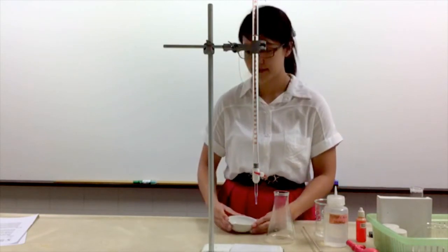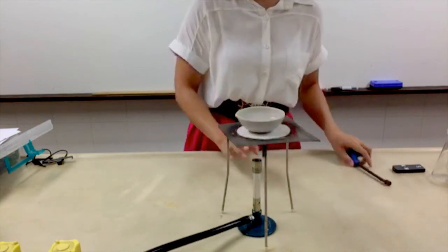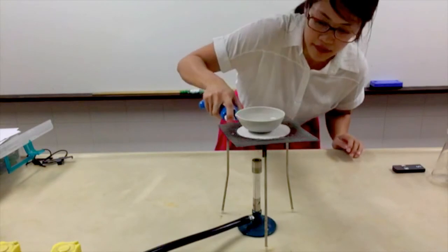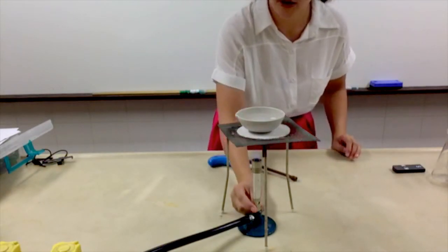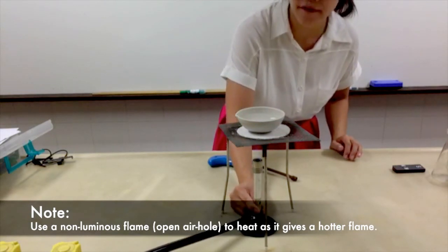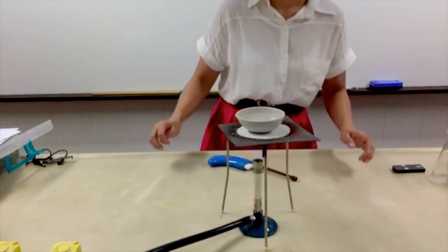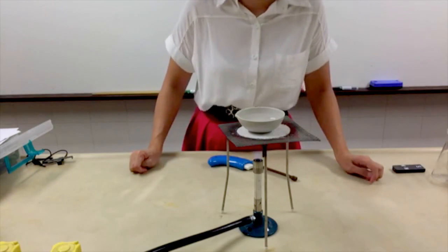Then we will evaporate our solution to dryness and let's see what will happen when we put this on the Bunsen burner. I place my evaporating dish on top of the Bunsen burner and I turn on my fire. Make sure that it is an open air hole because an open air hole gives a hotter flame.